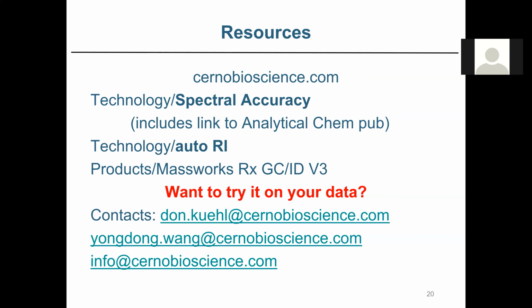Yes, you would. That's why, once I develop the external calibration, I always run it against the alkane itself, and I validate visually that all the peaks are properly located, because I know where they are. When it spits out that list in that window of where it thought it found the different alkane peaks, that's really important, and I generally validate against that.